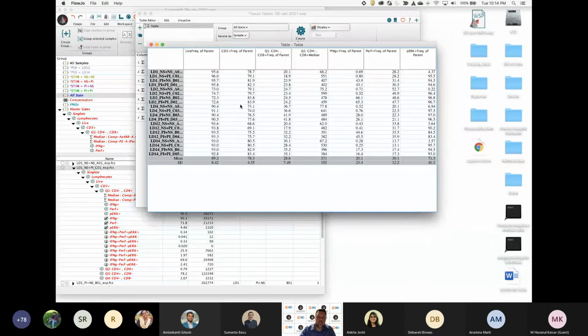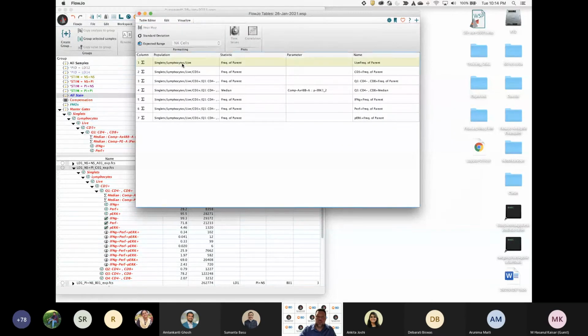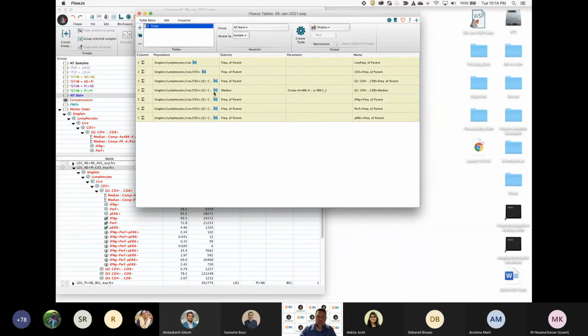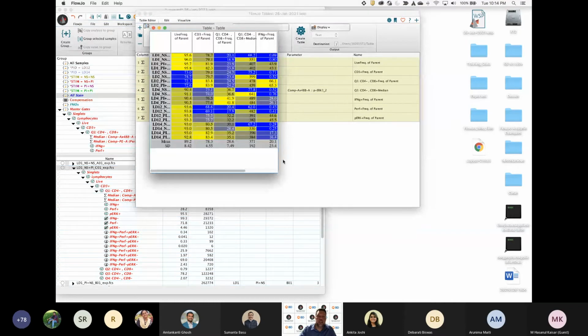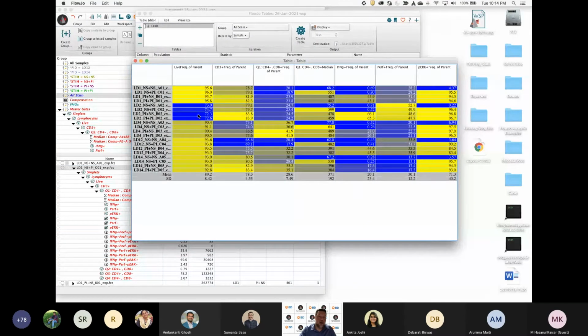The other thing I like to do is, each of these columns has variation, but the just black and white formatting doesn't show my brain that there's differences. You have to read the numbers to see those. Do know that you can actually add visualization under this Visualize tab to any set of columns, one at a time or in combination. I like to use the heat map option, and when I apply that visualization, it'll show an icon of what's going to be applied. Creating the table now individually heat maps each column with its own yellow to blue, high to low heat mapping, and immediately all the features and the changes start jumping out to me, right?